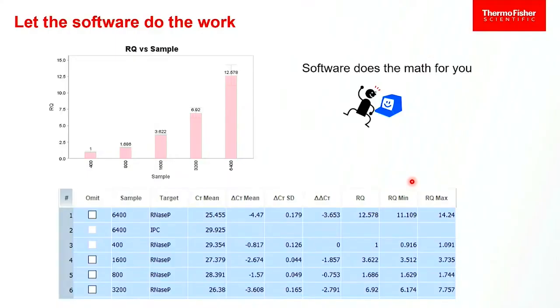Just a reminder, this is a twofold growth process, so your error bars are going to be asymmetrical. It also means that trying to execute this in Excel correctly can be difficult, because it's logarithmic. Yes?